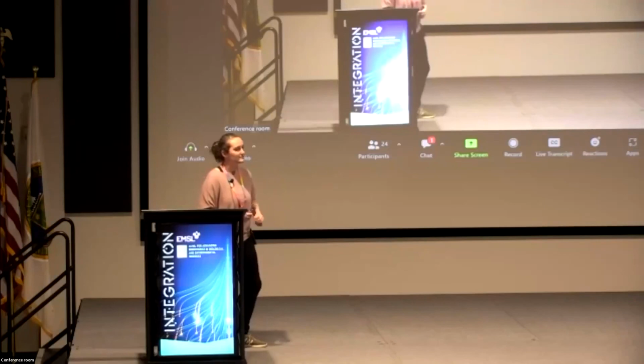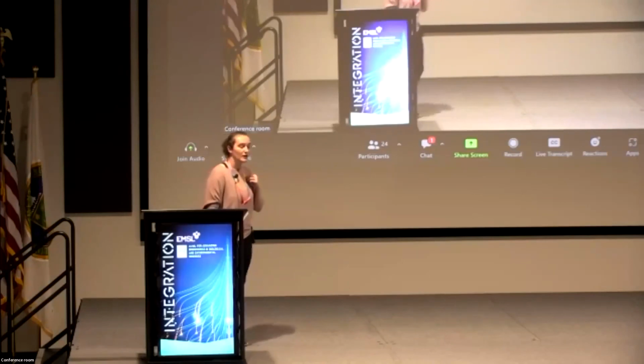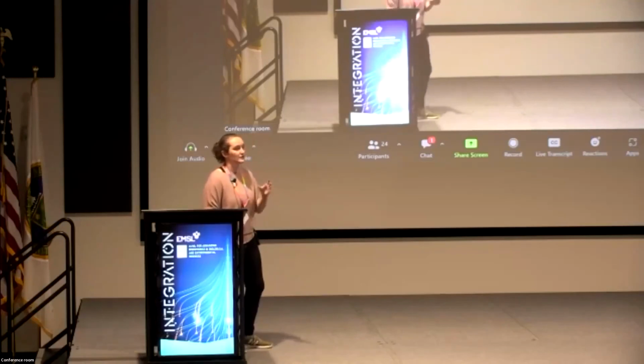And then the follow-up is, do you just have R packages that you've wrapped in some way, or can you just go in and code in R in this framework and load in some new package and run it? Yeah, so currently all of our applications are UIs. They require no coding whatsoever. We try to make it as easy as possible for our researchers. If you wanted to integrate a new application, you could go do that coding. But yes, a lot of them are based on packages that already exist in R in that space for actually running some of these analyses. Can't actually run R. No, not from the application.